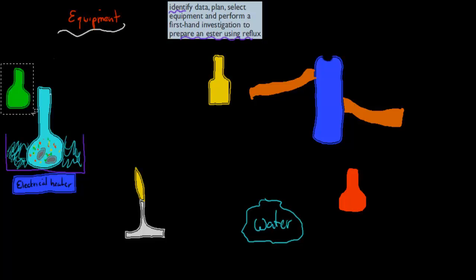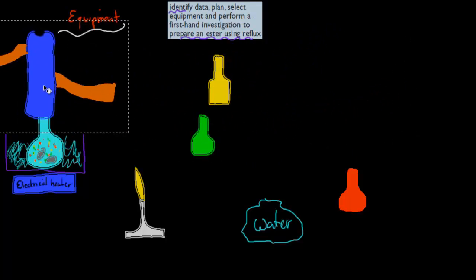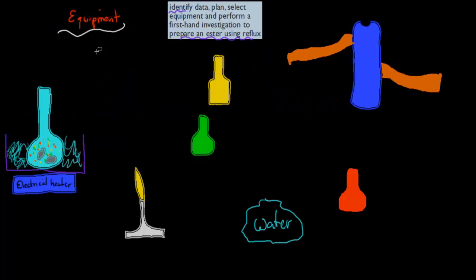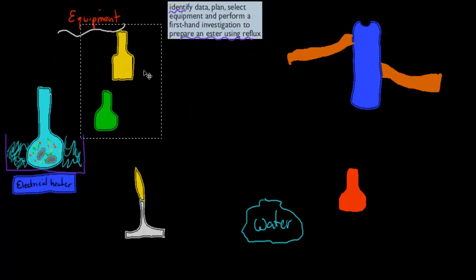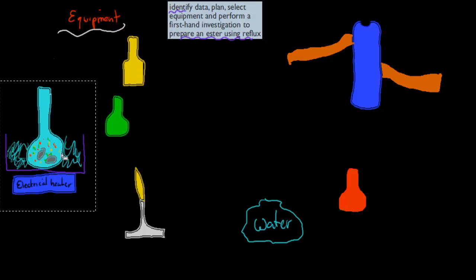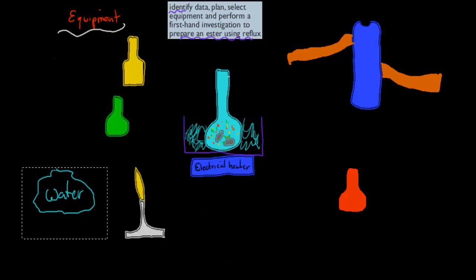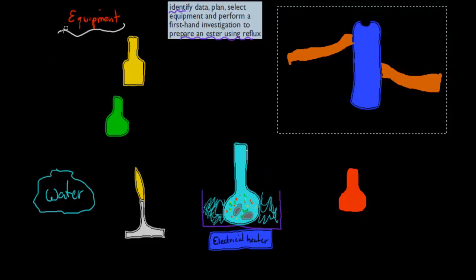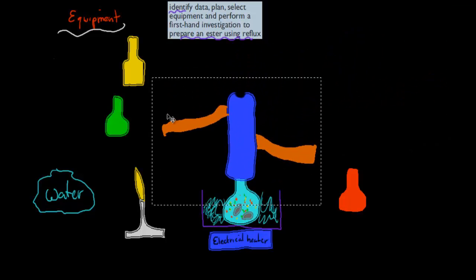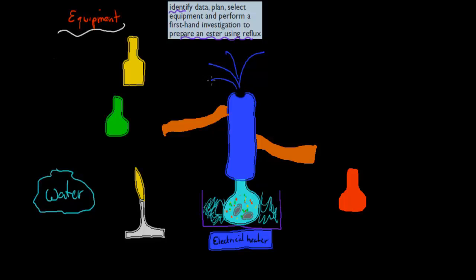So now we have all of it in there. What we want to make sure is we always have our condenser on. We would have checked that beforehand to make sure it's actually working properly. And this condenser makes sure that any rises in... You would have checked the condenser beforehand to make sure it actually works properly. You don't want to find out that it doesn't work properly during your experiment, so that means you're wasting your time. So you've checked that it works properly, that the water goes in and out where it's meant to go. So now we put the condenser on, and you might have found that there is an opening in the condenser as well. That means you can have gases, things escaping, and there's no buildup of pressure. Because otherwise there might be too much pressure and that could increase the chance of an explosion. So we tend to have a bit of an opening just for certain vapors to leave.